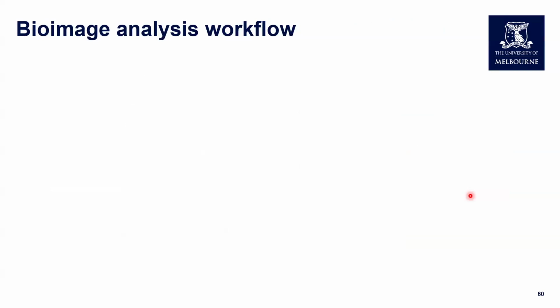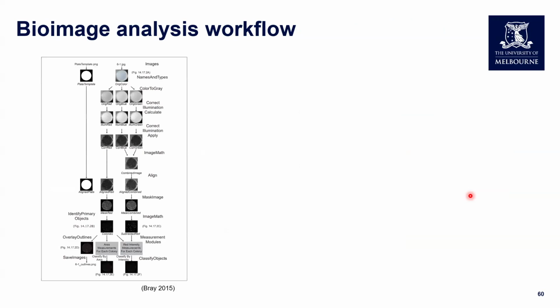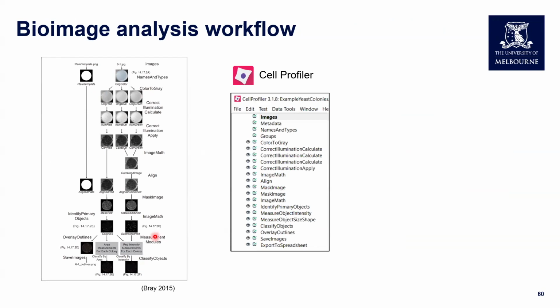So as you can see, most bioimage analysis workflows are done in multiple steps. And this is one of the published examples where the process is documented clearly as a flowchart. And some software like CellProfiler provides environments where those types of workflow can be designed within the program. In this program, you can easily add or delete individual analysis modules and make your own. Once done, the pipeline can be used for batch analysis. Also, the workflow can be saved as a file, which can then be used as your own record keeping and also shared with other researchers.